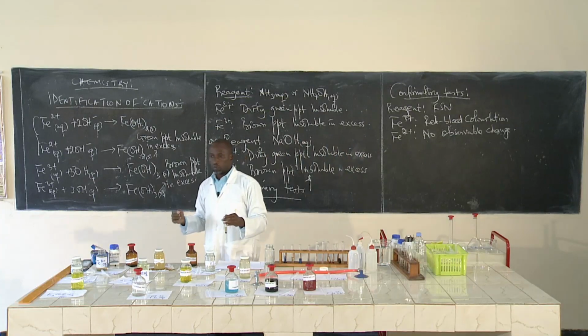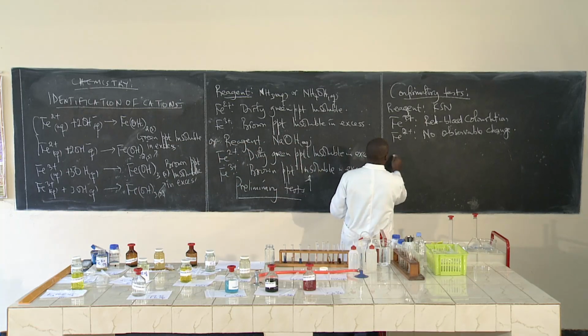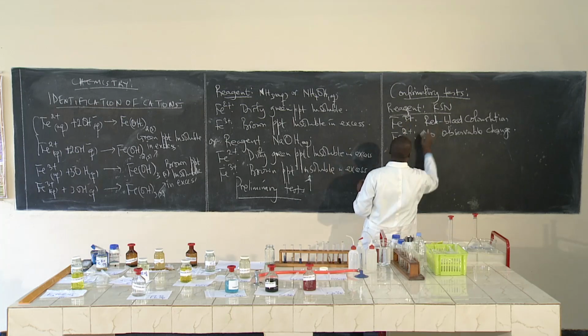We also used another reagent that we can use.